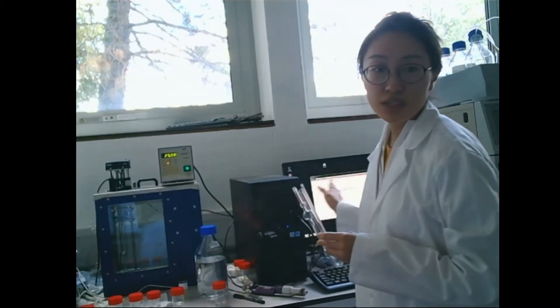Hello everyone, welcome to the Vitalis Group. Today we are going to show you how to use the viscometer to measure the viscosity of a liquid.